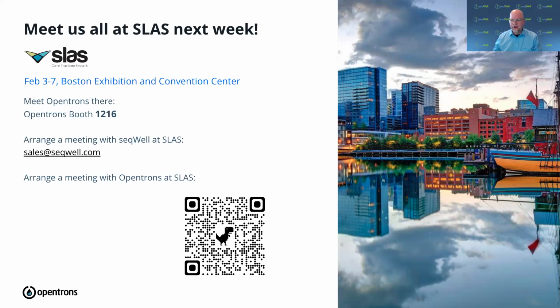Question is 20 cents per sample the cost per library prep or sequencing? That is referring to the sequencing cost. So if you divide a cost of MiSeq or NextSeq flow cell, which is generally in the $1,000-ish range for the capacity required to do that many samples, and divide that by 6144, that's where I'm getting that number. That does not include the library prep cost. Does seqWell have a PCR-free WGS kit for human mouse samples? We do not at this time.